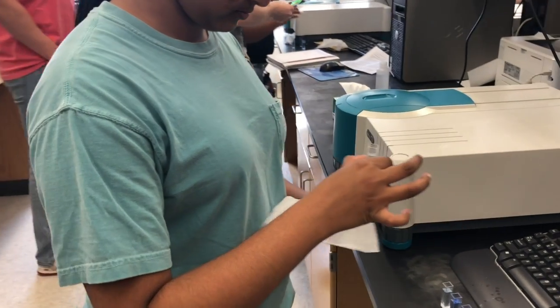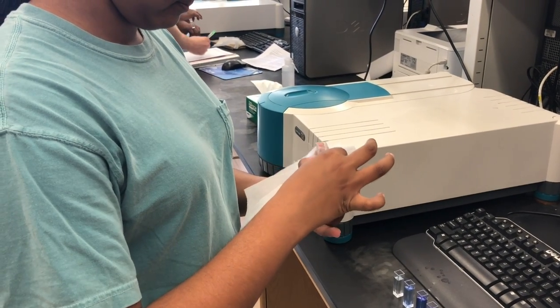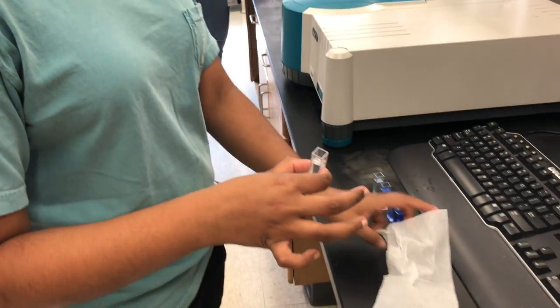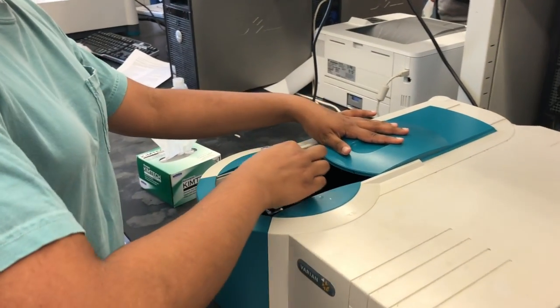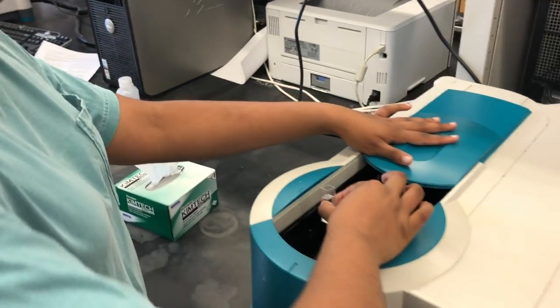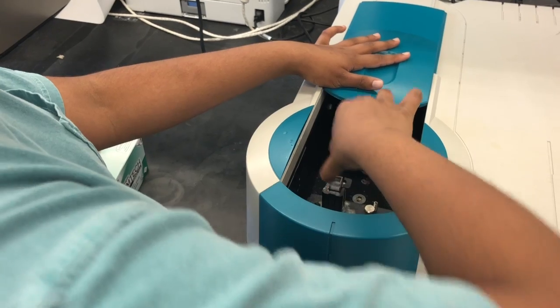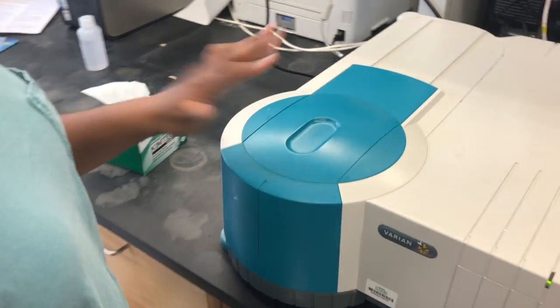In order to zero out the spectrophotometer, we had to use a blank solution of ammonia. First, we had to clean two sides of the cuvette. Then, we carefully placed the cuvette with the ammonia in the spectrophotometer with the clean sides facing the beam. We closed the lid of the spectrophotometer before scanning the sample.